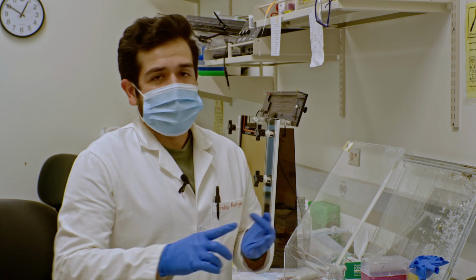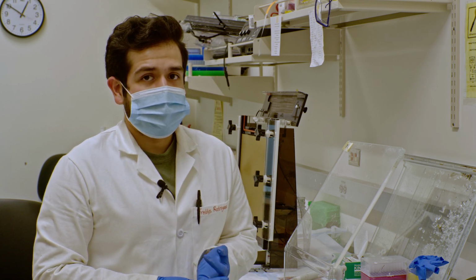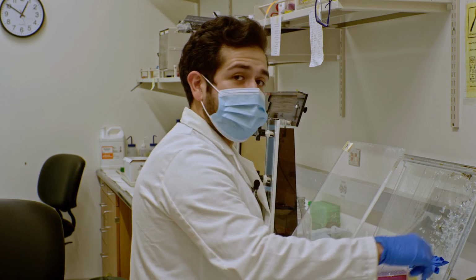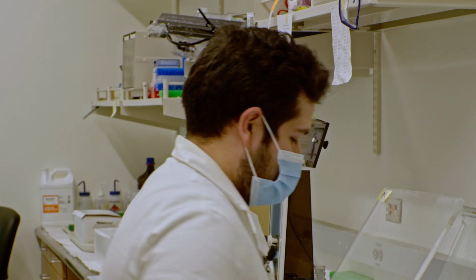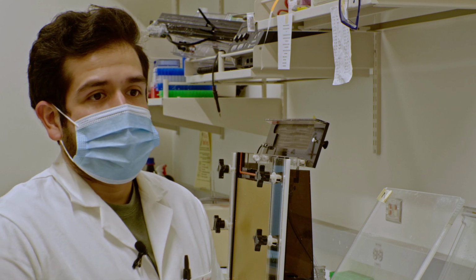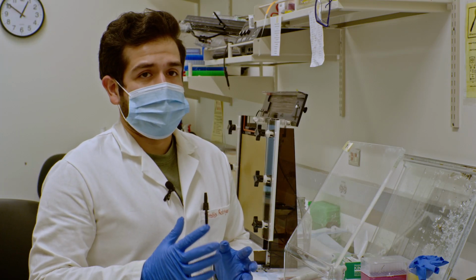The one thing that I only do here in this room is whenever I get my primer, that's always on ice, by the way. Keep your stuff on ice until you have to take it off of ice and add stuff. The one thing that I add here in this radioactive room is, of course, the radioactive ATP, or gamma P32 ATP, whatever you want to call it. What happens is when you use T4 PNK enzyme, which stands for polynucleotide kinase, it takes that gamma phosphate, which is the terminal phosphate on ATP, and transfers it over to the 5' hydroxyl position of your DNA primer. And by doing so, it effectively radiolabels your DNA.